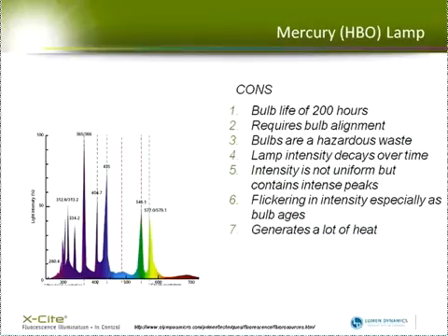They also generate a lot of heat, so you need to make sure that heat gets dissipated, and if you're going to be doing long-term experiments, you may need to put the lamp on for a little while to equilibrate because it will heat up the microscope as well. So there is a fairly long warm-up time. It should be warmed up at least for an hour before starting experiments.